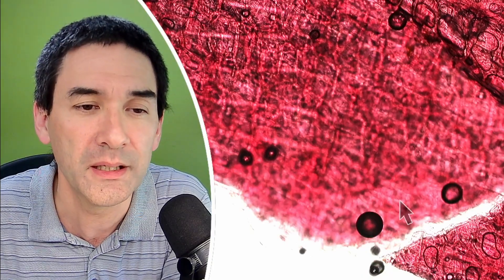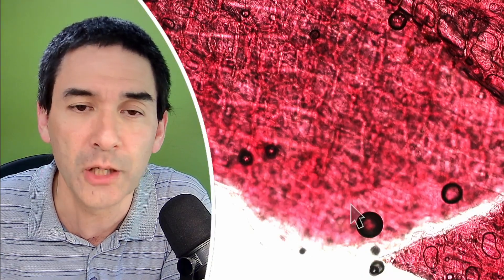Okay, so let's have a look at a slightly different place over here. Yeah, here it's a little bit darker. We have to refocus again. But again, we are able to see small bubbles everywhere. Again, I think they don't really disturb very much. They're not that big. And maybe it would have helped to simply submerge the onion skin into the water for a couple of minutes, give it a little bit more time maybe to soak up the water that would have probably helped. But here again, we see it quite nicely, those air bubbles.